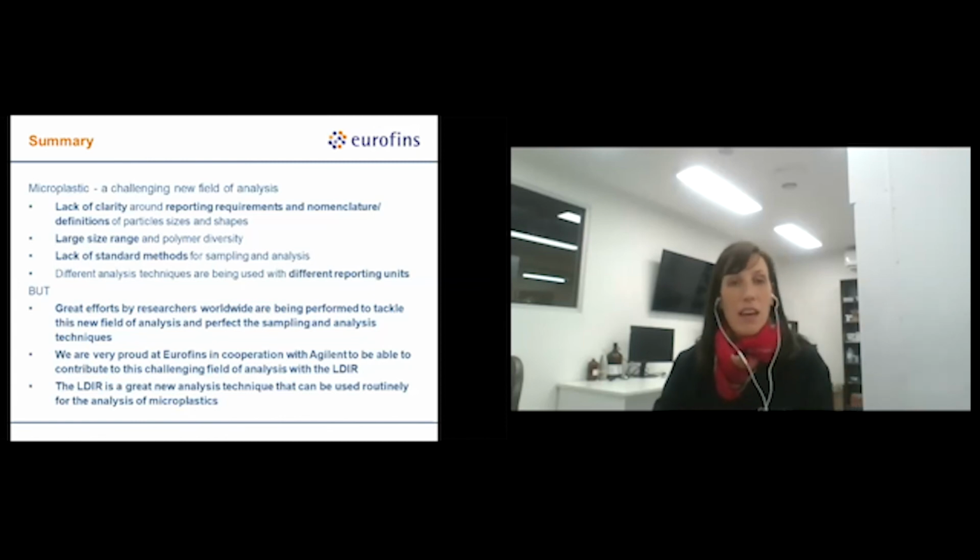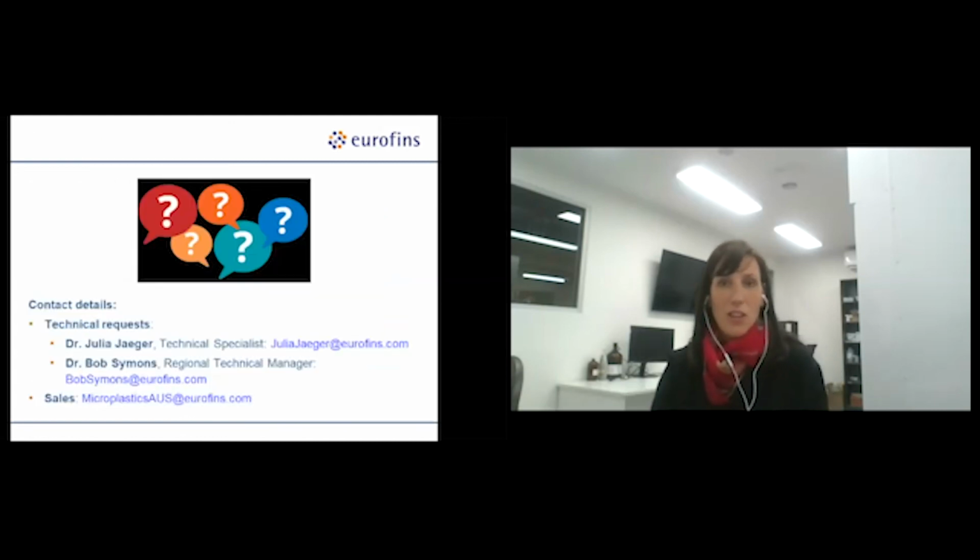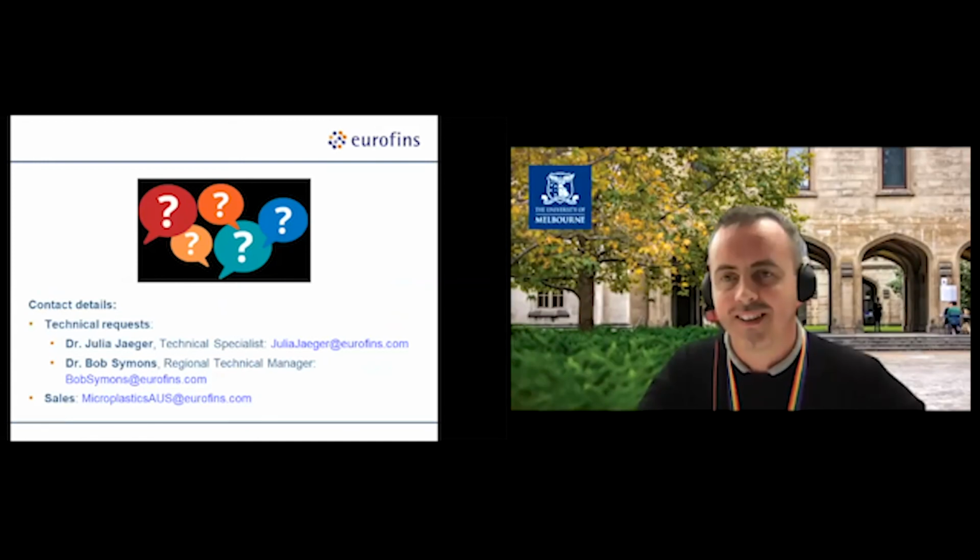But I think there are great research efforts being made worldwide to tackle this new field of analysis. And we're very proud at Eurofins, in cooperation with Agilent, to contribute to this challenging field. In our opinion, the LDIR is a great new analysis technique that can be used routinely, especially in comparison with the FTIR, which takes longer for the analysis. And I'd like to thank you for your attention, and I'm here for any questions.